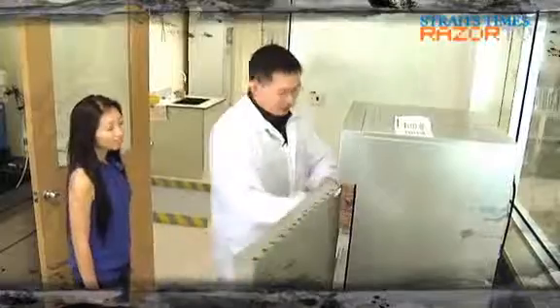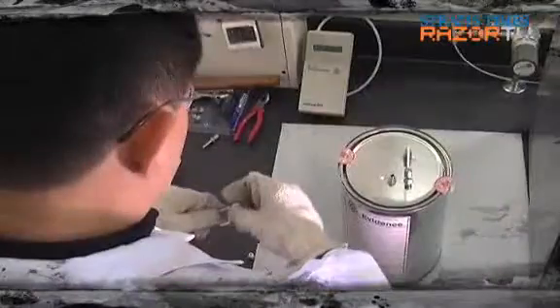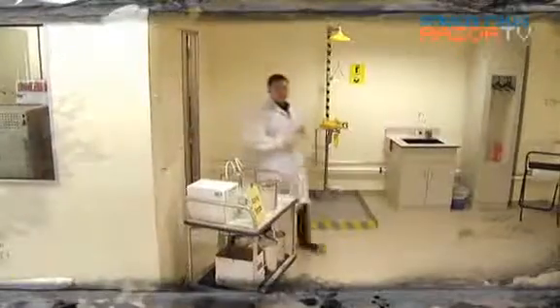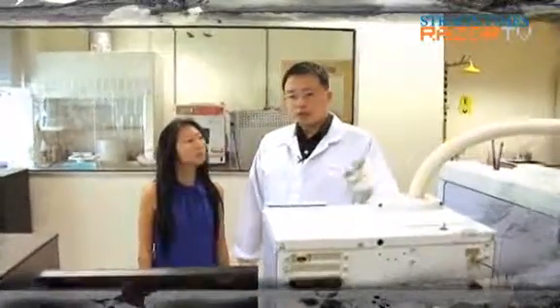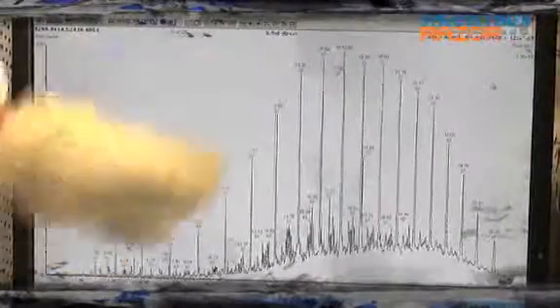After the process, we open the oven and take out the tin. And take out the absorption tube. Basically, you put the absorption tube into this machine. This machine is known as a gas chromatography mass spectrometer, and we start the machine. So what does it do? Actually, this machine will generate a graph like the one you see here. Okay, this graph, then we analyze.